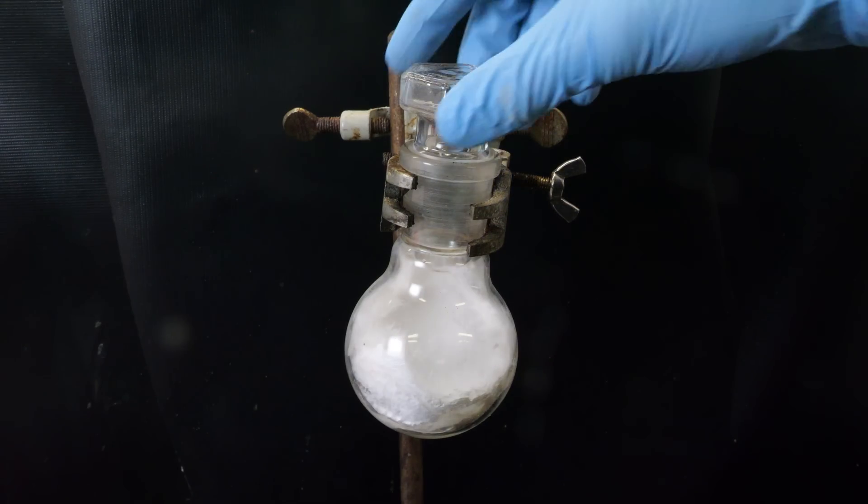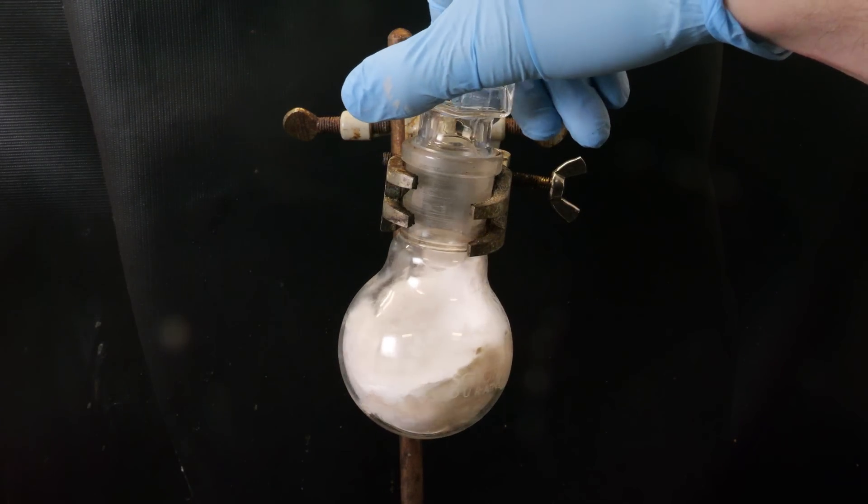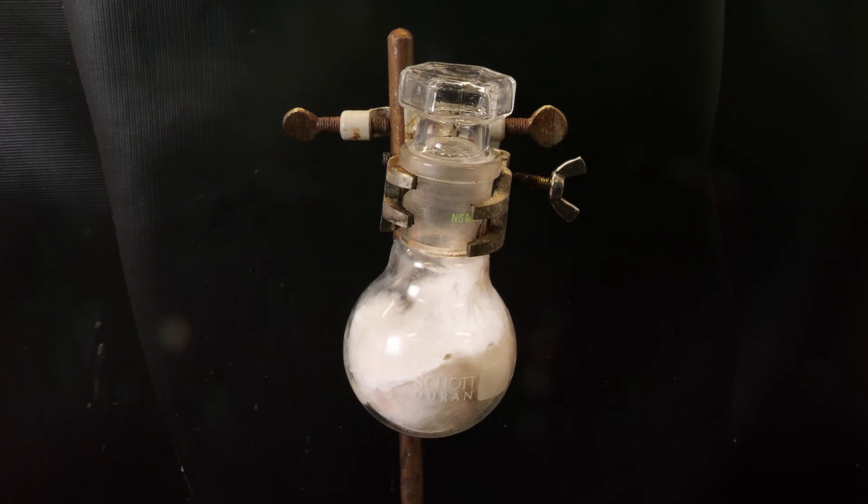Since sulfur trioxide is a master of destruction, it also destroys traces of grease left on the joints and will turn them into liquid black tar, of which some dripped into the receiving flask, giving a slight discoloration. However, it shouldn't matter for my reaction, and it's actually quite common for oleum as well to be discolored because of some tar impurity.